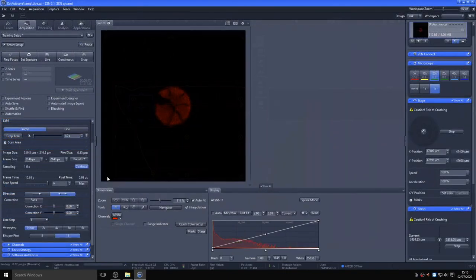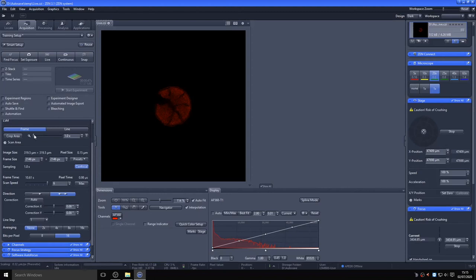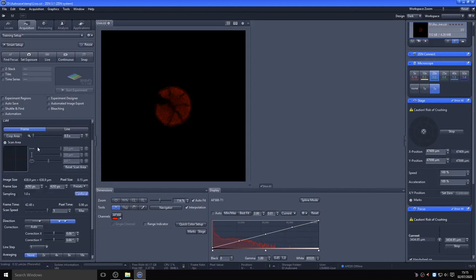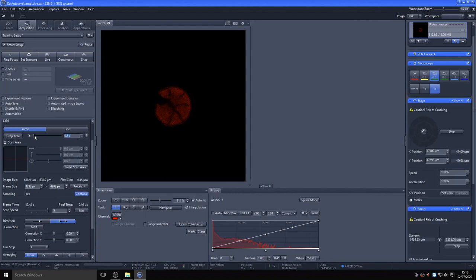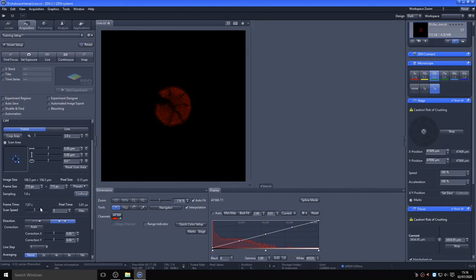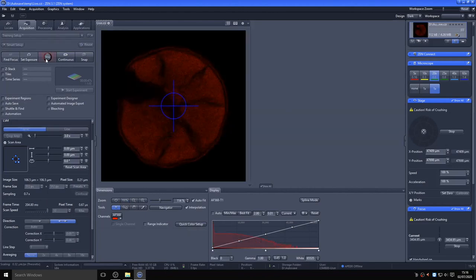In a similar way to being able to zoom out from the 1x to 0.5x confocal zoom to show the sample at the edge of the lens as you would do if you wanted to tile a large region, there is also the option to zoom into your sample. The physical resolution of your image is determined by the lens, but by zooming in and focusing on the specific area within the field of view, you can not only scan the area faster but you also reduce the impact of bleaching on the surrounding area. If you are to image at maximum possible confocal resolution as determined by the lens characteristics, then reducing the field view will reduce the number of pixels required. So a 3x zoom will require one-ninth as many pixels. This is easy to achieve using the confocal button.